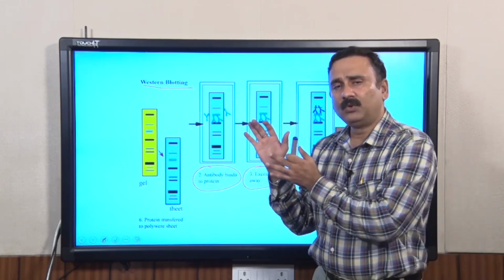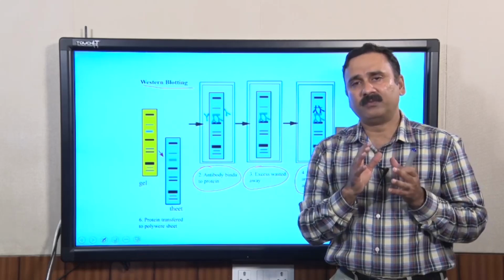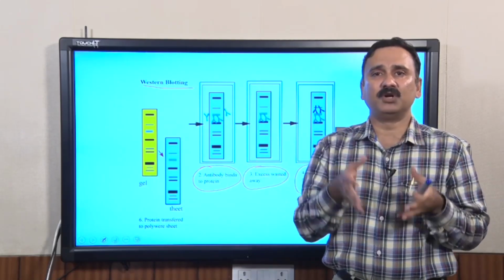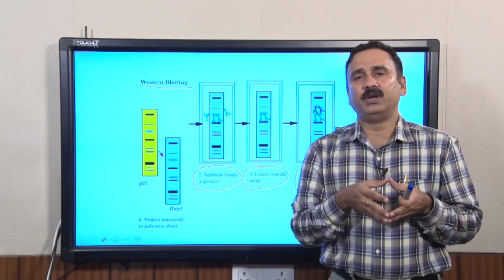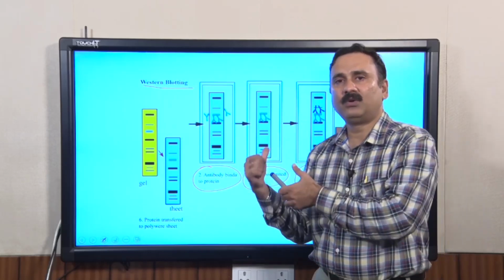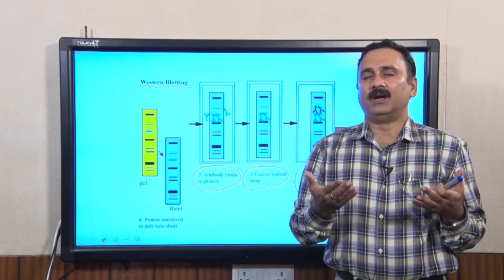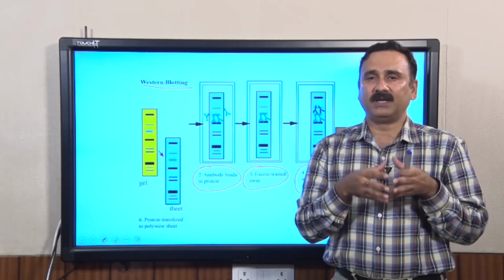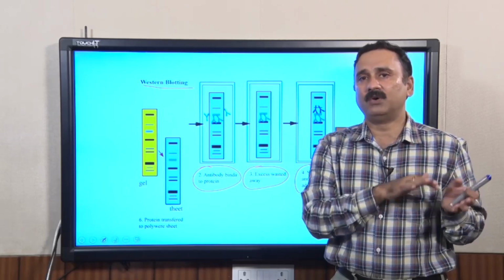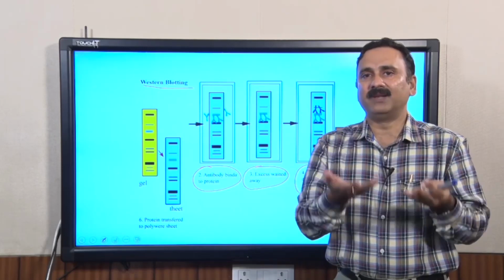To show you a small demo of how to perform Western blotting, we have performed all these steps in our laboratory, and Banesh is going to show you all these steps, so that you will not only get the theoretical knowledge, you will also get the practical knowledge about how to set up these cassettes, how to transfer the gels, how to do primary and secondary incubations, and how to develop the blots.